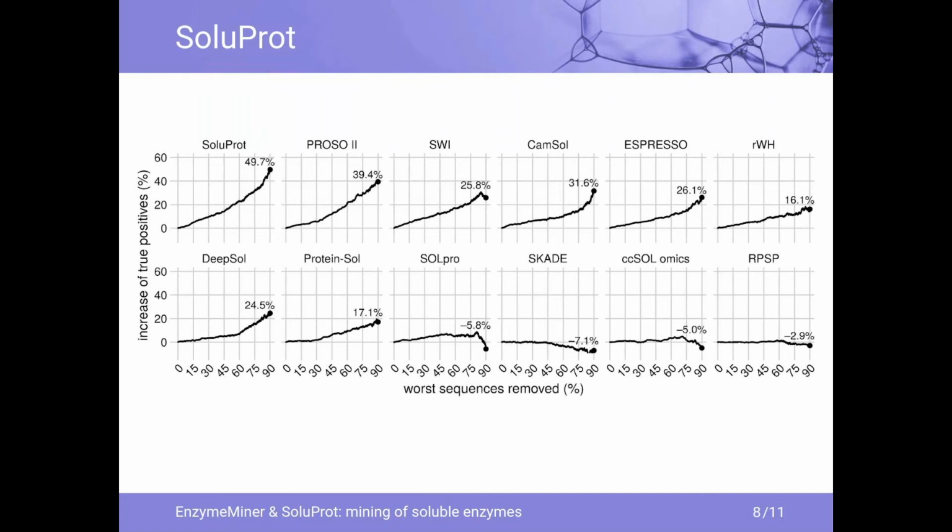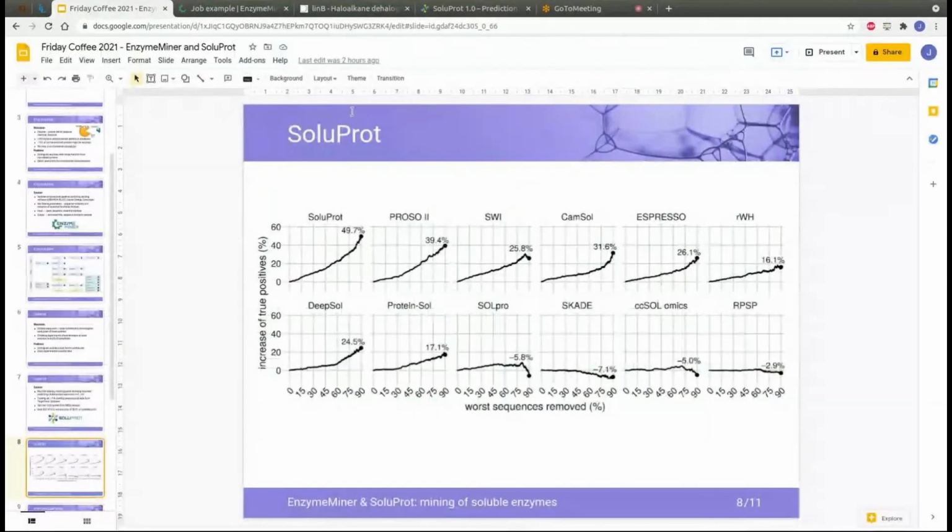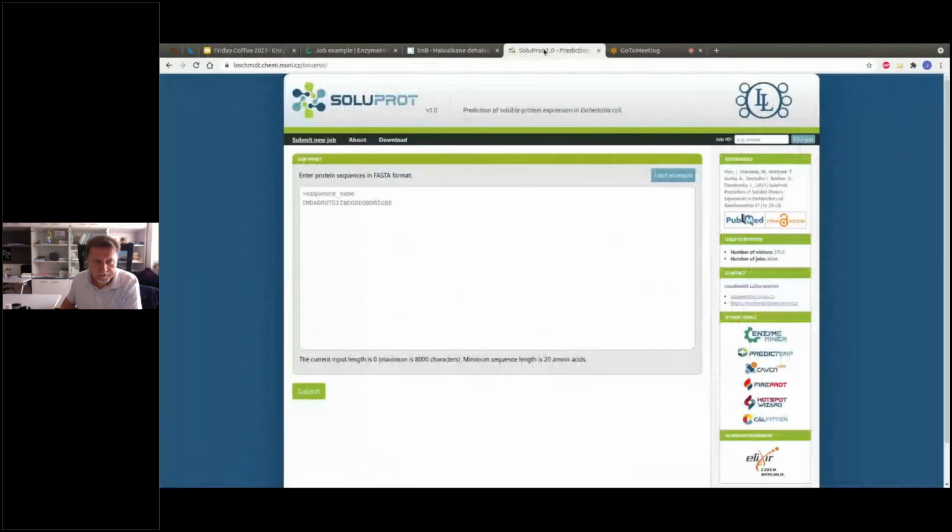So that's all for SoluProt. I would just show you the web interface. It's very, very easy. The only input is a FASTA sequence. Protein sequence is in FASTA format, actually. So I will click here to load the example so you can see how it looks.